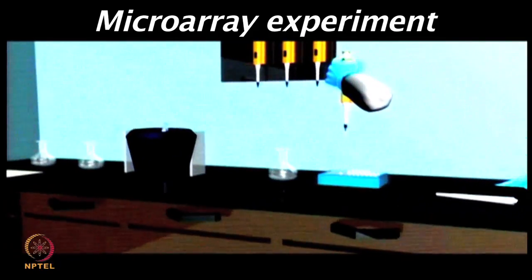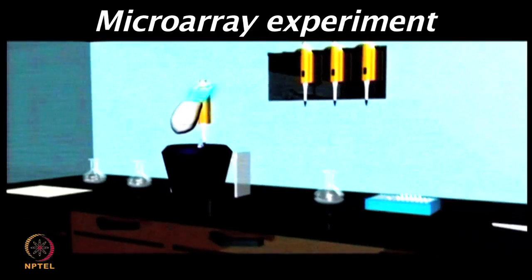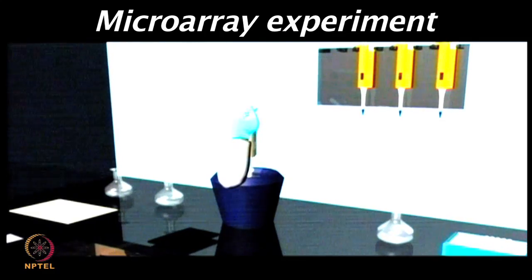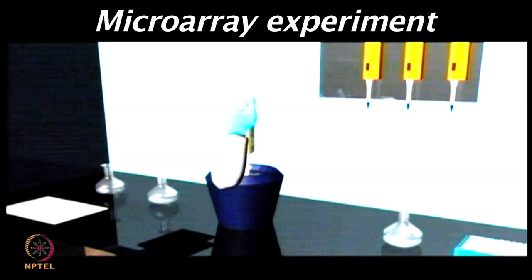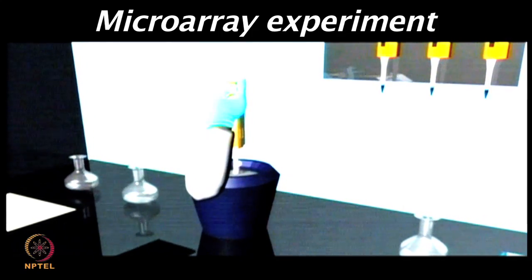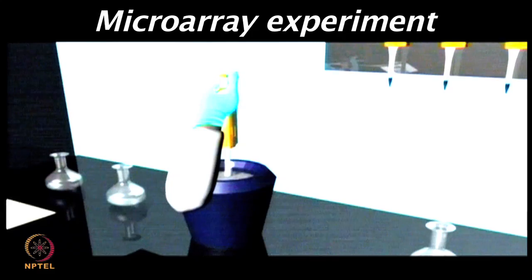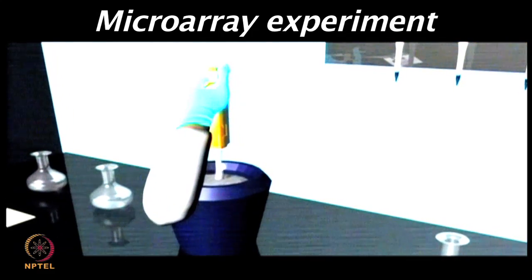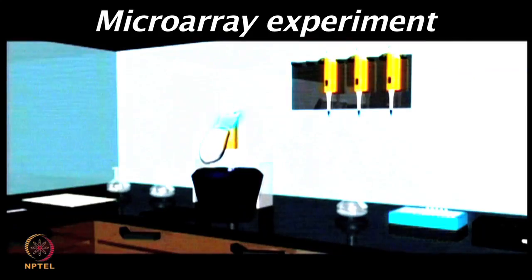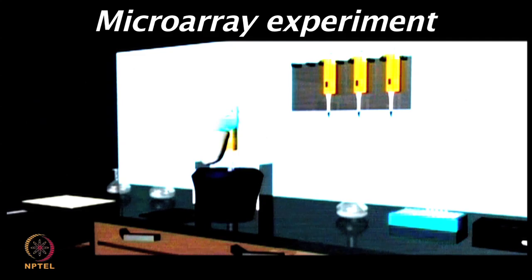So, now once the blocking is completed, one can apply the primary antibody. As I mentioned, it can be a primary antibody or it can be serum if you are looking for the immune response detection. Now, one needs to ensure the right dilution, because most of the time the serum gives very high background on the chip surface. So, appropriate dilutions can be optimized based on the requirements.